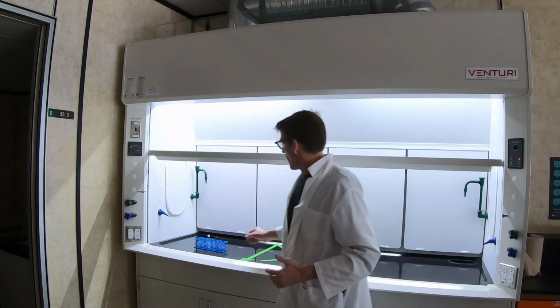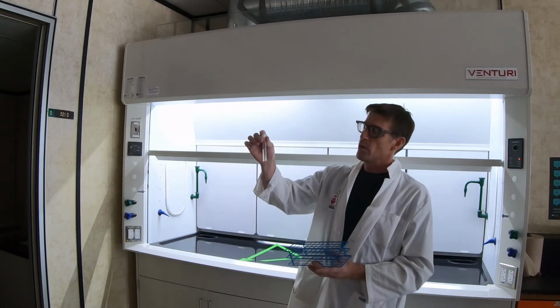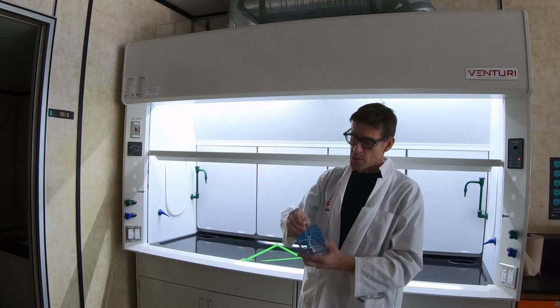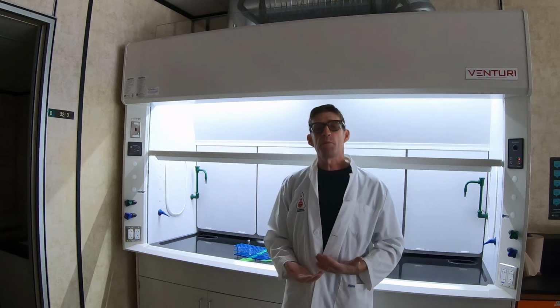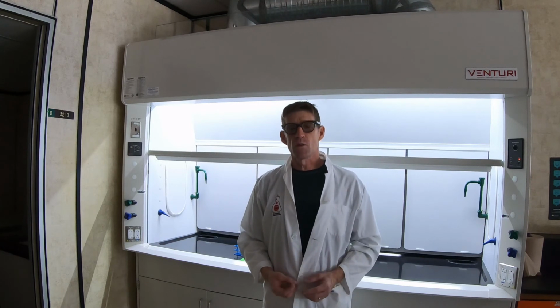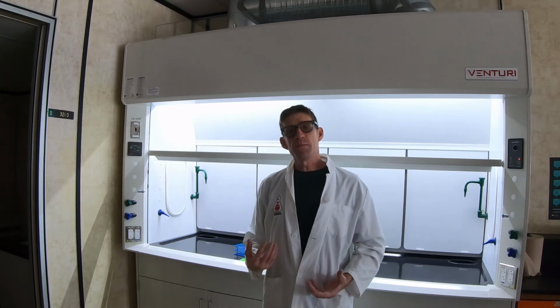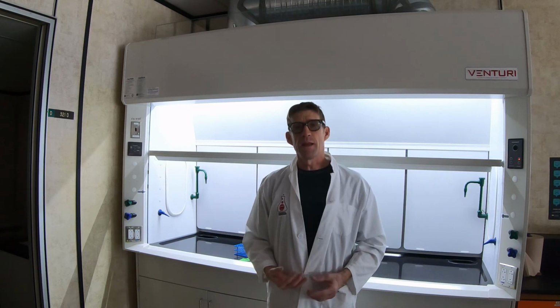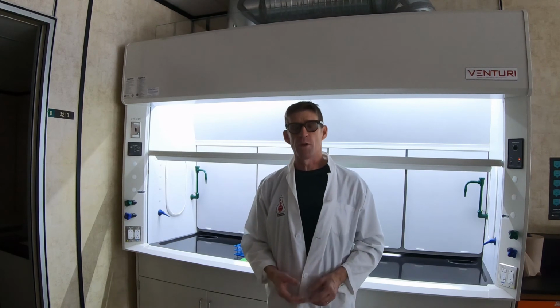One of the things that I should mention, our material is murky. I think we showed that in the earlier picture. That is because water distilled over with it. The experimental, as written in the lab manual, suggests that it be worked up with brine to remove some of the water, followed by a treatment of the organic layer with a drying agent. That's not required in this lab. This material is quite volatile. The cyclohexenes and the pentenes are volatile, and if you could smell it, you would appreciate how volatile they are.